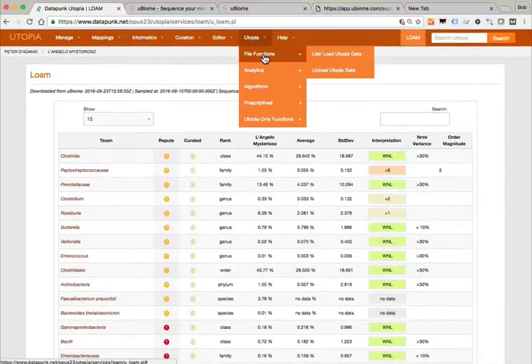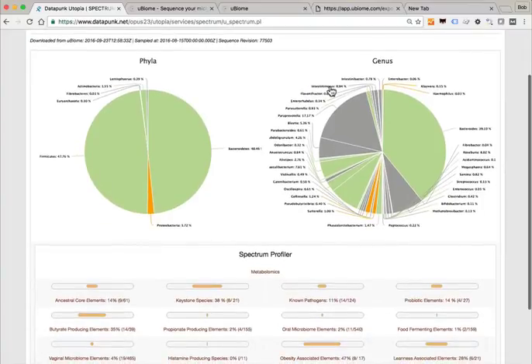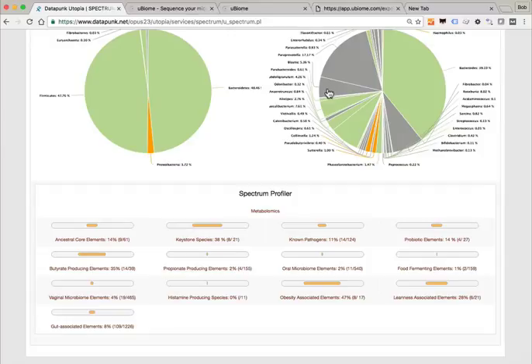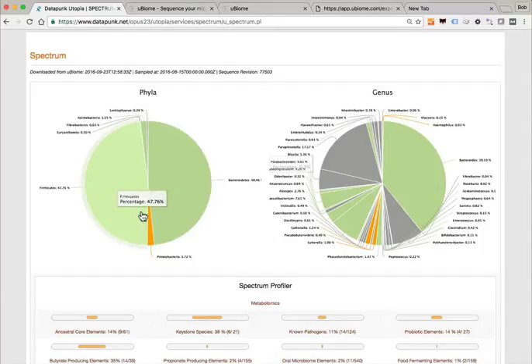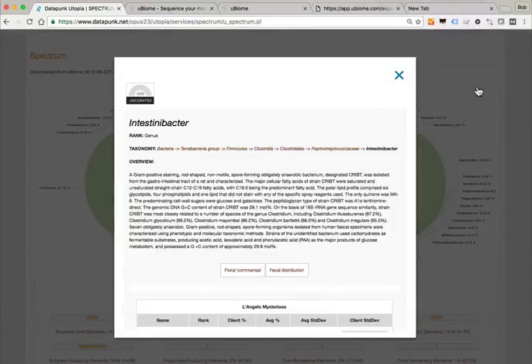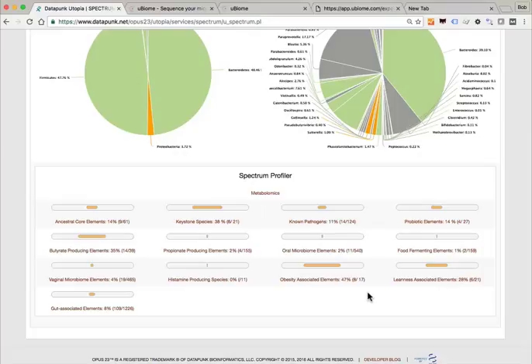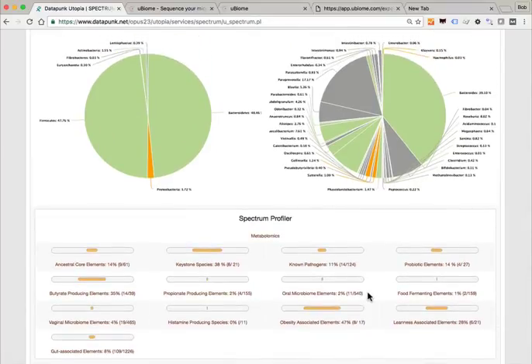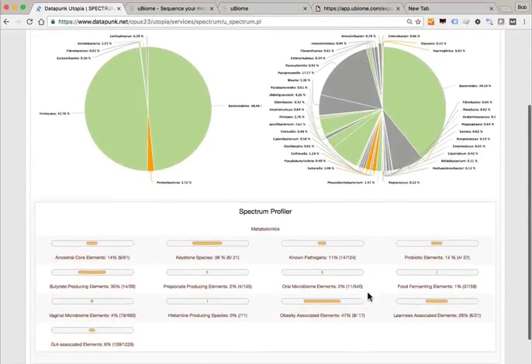Spectrum is more of a community organization app with a lot more emphasis on visuals. The idea is to try to come up with an idea of what the general community characteristics are. We get a very attractive pie chart that gives you insight at the genus and phyla levels — everything is clickable. There's a little profiler at the bottom that gives you by categorical approach: how many species qualify as keystones, how many are known pathogens, how many are part of the oral microbiome, how many are capable of secreting histamine, and so forth.